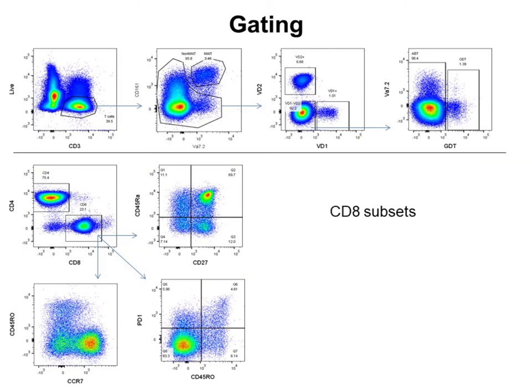Here I'm showing you the gating of the populations of the extended T-cell core panel. This is quite a full panel using the full capacity of the Symphony, and you see the nice resolution of the populations.